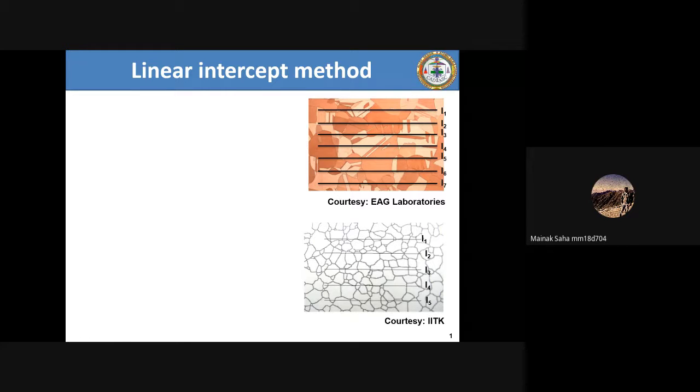In simple words, when there is a polycrystal, two crystal structures are separated by the grain boundaries, and each crystal is called a grain. Right, exactly. Each crystal is called a grain, not a structure. When you talk of structure, you talk of symmetry and all. You are not talking of symmetry when you're talking of grain. Of course, when you're talking of the orientation, then you are talking of the structure and the symmetry, thousands of things. But especially when you talk of a grain, you are not talking of structure.